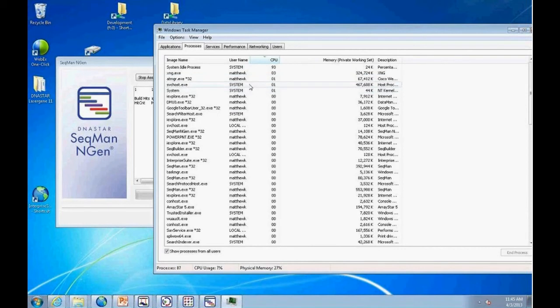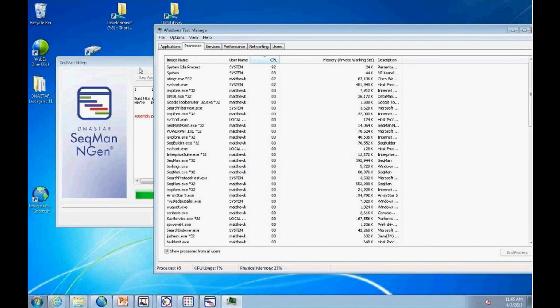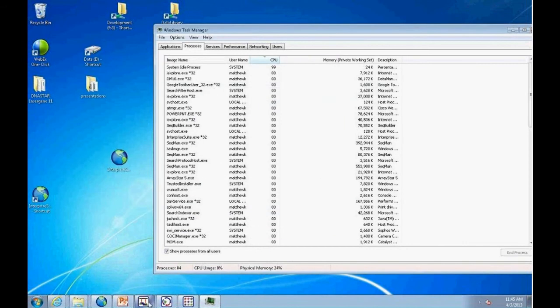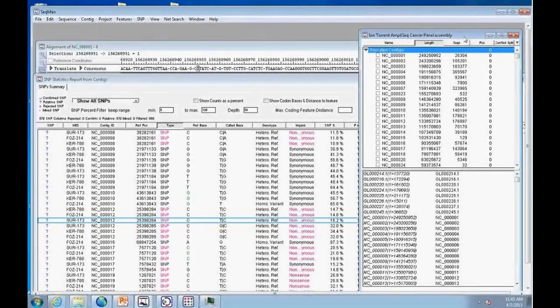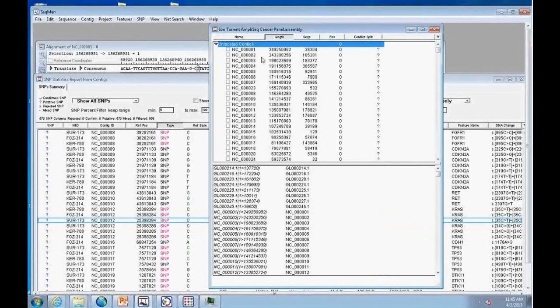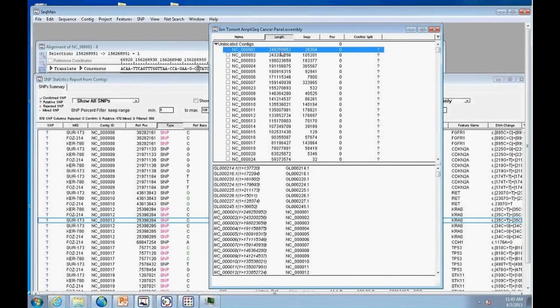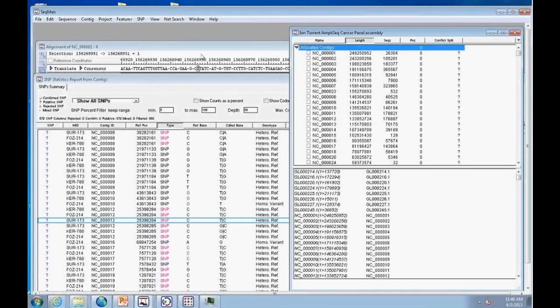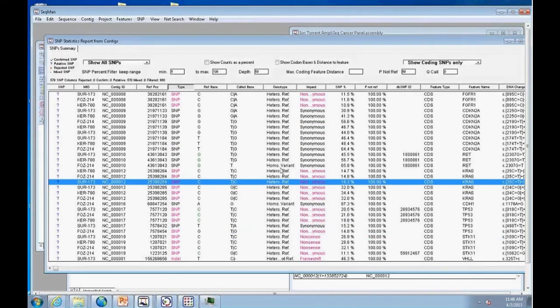In SeekMan Pro, the list of contigs now corresponds to chromosomes. Human chromosome 1 is shown at 250 megabases with the number of aligned sequences. The cancer panel targets different exons and genes across many chromosomes, so most chromosomes are present. You can see which targets have the most sequences. Running a SNP report for the entire project by clicking the header and selecting 'SNP report' generates a comprehensive variant table.